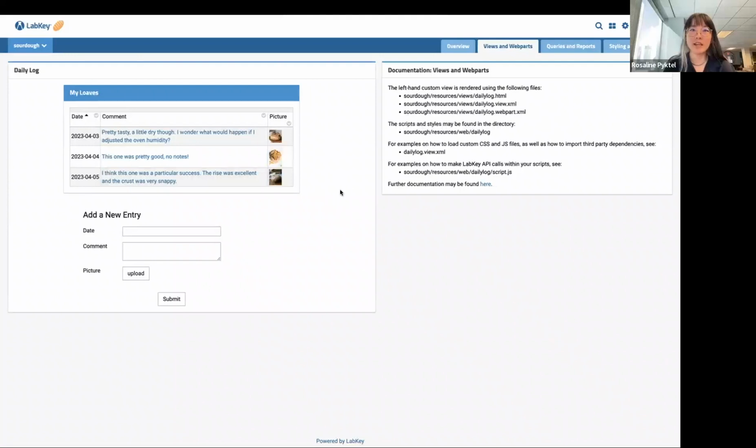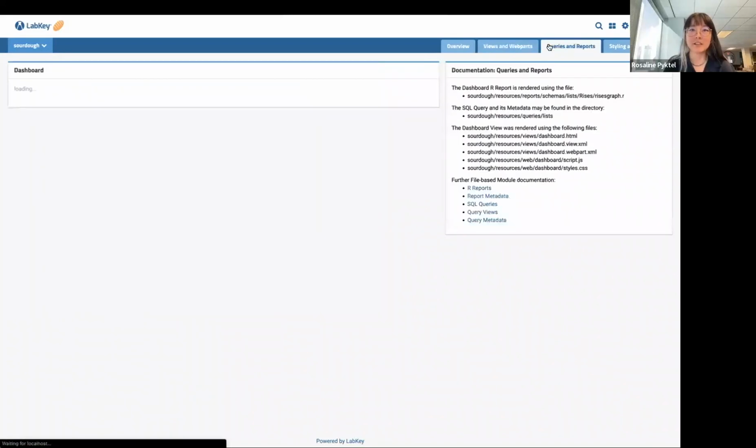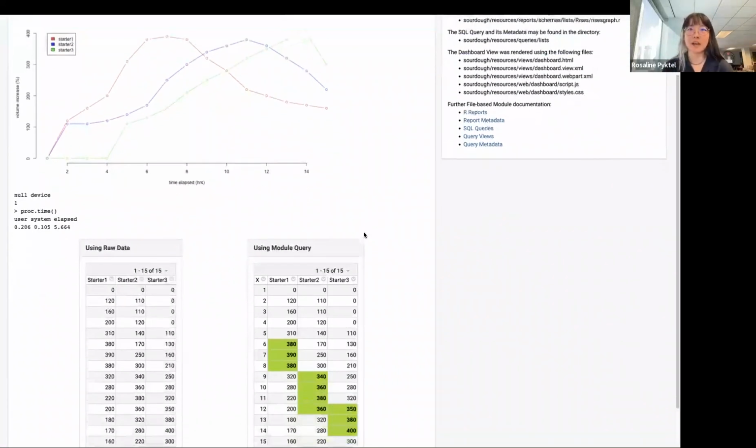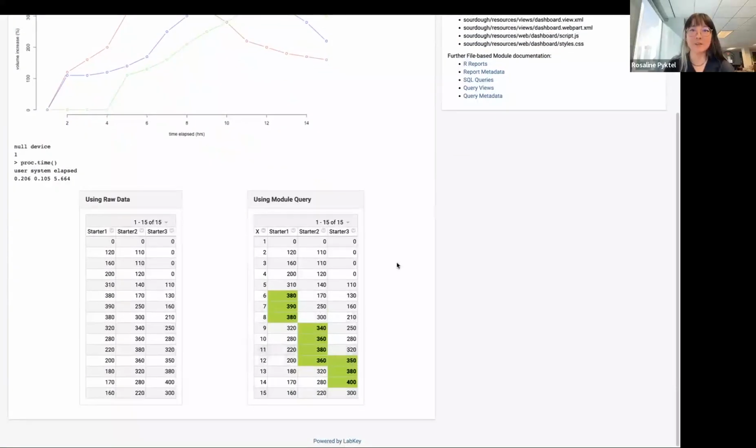We have also loaded in data, seen also here, pending our report generation and execution. We've also added a fun little icon up there. Woohoo. And yep, our module has also delineated an R report and executed custom LabKey SQL to give us a grid that we have applied metadata to.